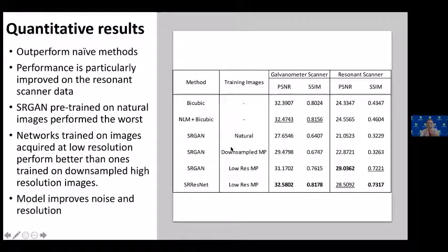And we also trained similarly to what they used for the original SR-GAN, where we downsampled our high resolution data into low resolution data to use those as a pair, rather than using the acquired low resolution image here. So you can see that with that training, the model performance was not as good as what we have with the real world data.